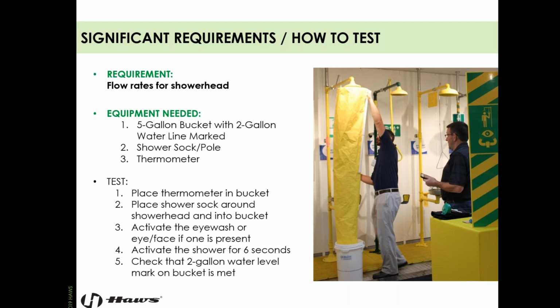If you're not testing a shower, you want to know the temperature of the eye wash or the eye face wash, and there is no shower. Just place the thermometer into the flow of the eye wash, and that's how you can test it. I would also caution you from using laser temperature devices. Make sure that you're aiming it at something that's directly in the pattern, not through the water at something like the wall. It'll really mess with your outcome.